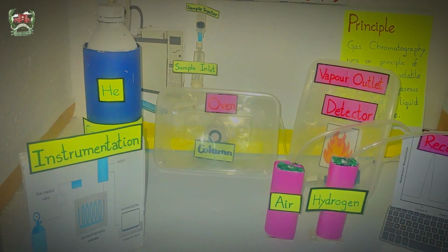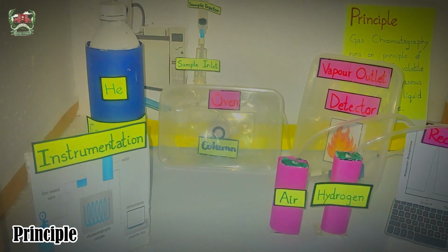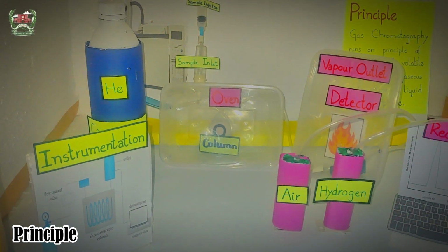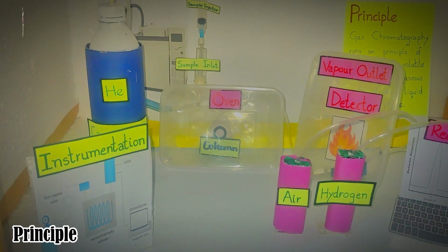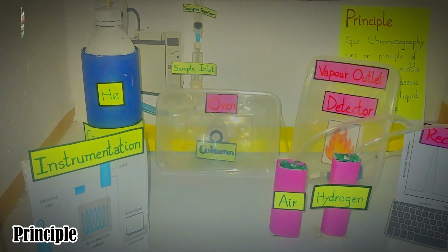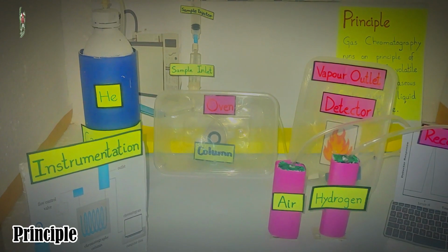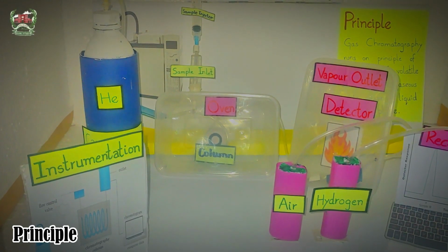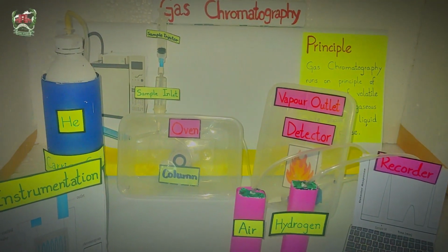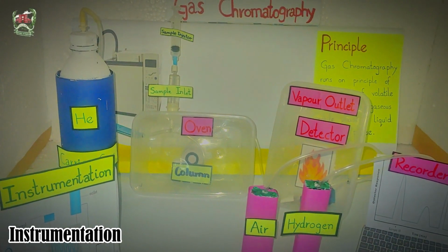So now moving toward the main principle of gas chromatography. So what is the main principle of gas chromatography? Gas chromatography is a partition. When the sample enters into the sample inlet, it is converted into the vapor phase or the gaseous phase. These sample components in gas phase are linked with the mobile phase, and with the help of partition they are separated out.